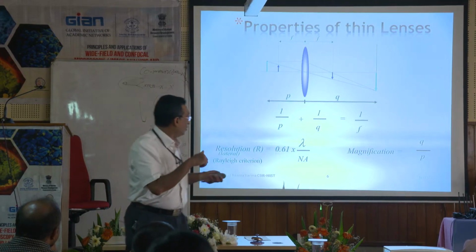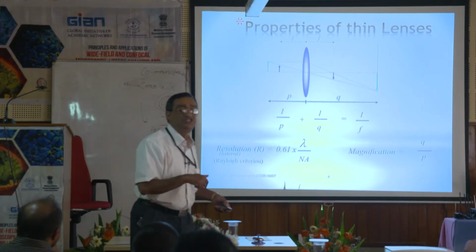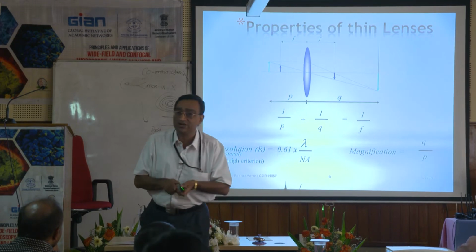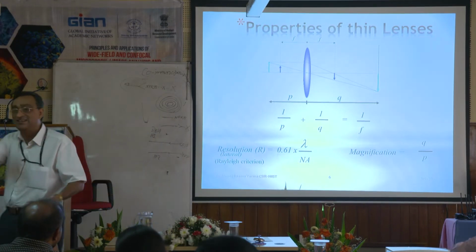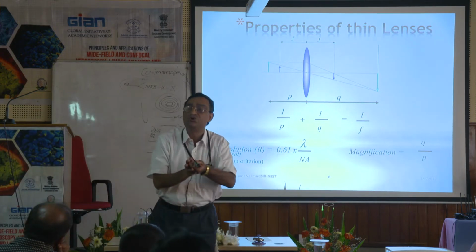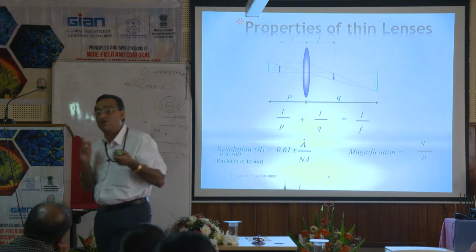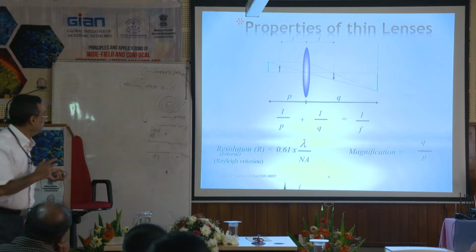So this resolution is not very high. As I told, it is almost 0.2 micrometers.